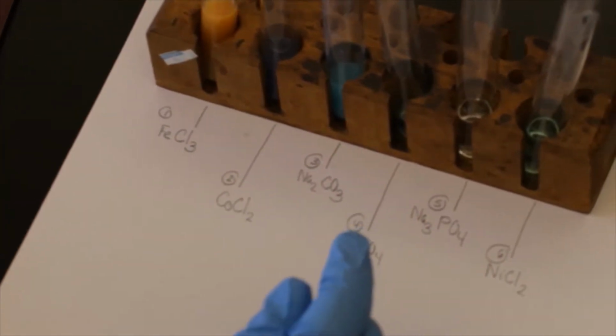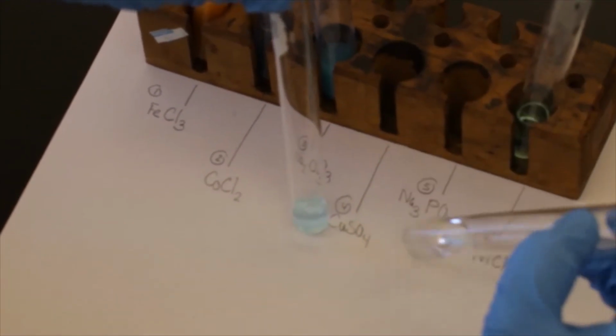Now if we are on letter D, it asks us to transfer half of solution 5 into the remainder of test tube 4. So here's 5, and 4, so CuSO4. So we're going to mix in Na3PO4 to CuSO4 and see if anything happens. So we're going to pour half in.